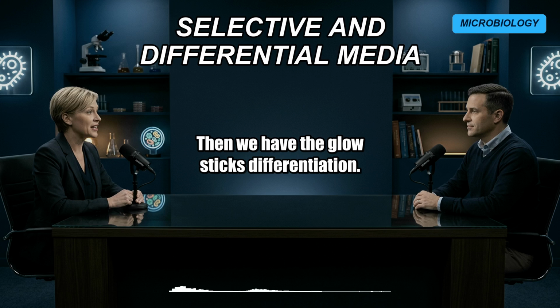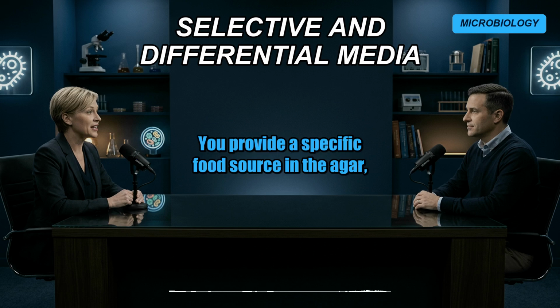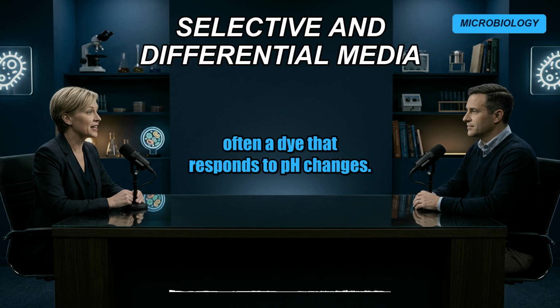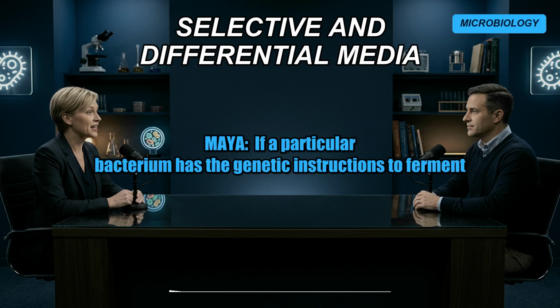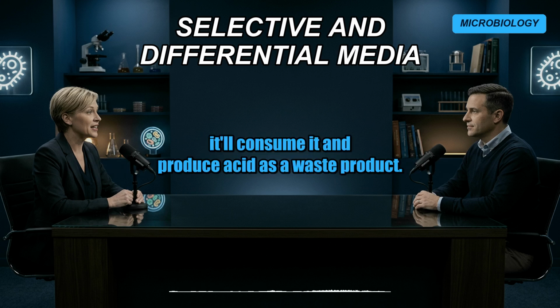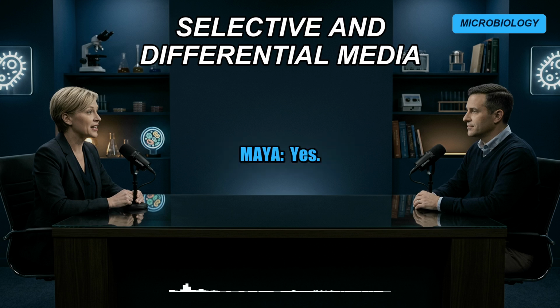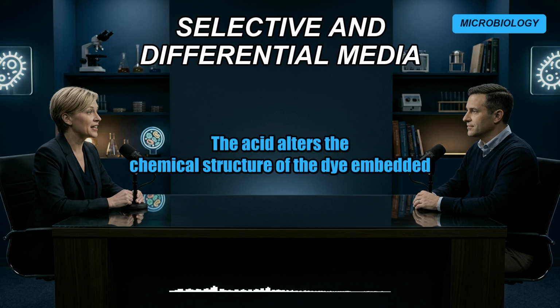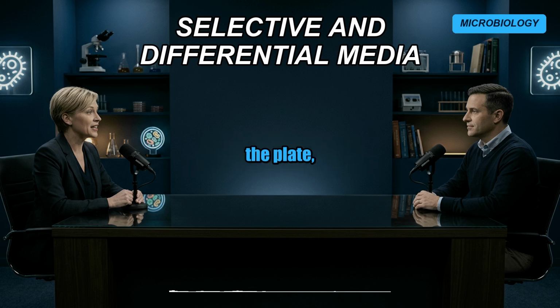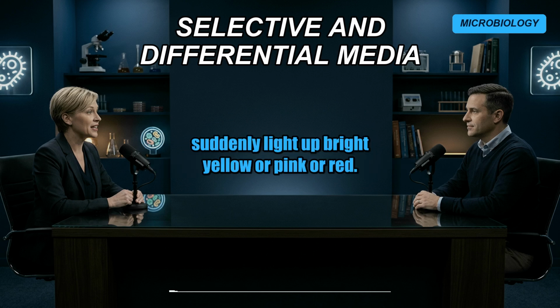Then we have the glow stick's differentiation. Right. Differentiation relies entirely on exploiting metabolic differences. You provide a specific food source in the agar, usually a type of sugar, and you pair it with a visual indicator, often a dye that responds to pH changes. Okay. If a particular bacterium has the genetic instructions to ferment that specific sugar, it'll consume it and produce acid as a waste product. And that acid drops the pH of the jelly locally, right? Like right around that specific colony. Yes, the acid alters the chemical structure of the dye embedded in the agar, causing it to change color. So if 10 different types of bacteria are growing on the plate, the one species capable of fermenting that specific sugar will suddenly light up bright yellow or pink or red.